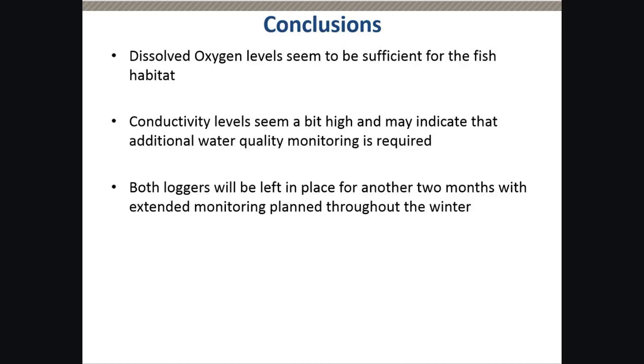Both of the loggers will be in place for another 2 months. After that, we will remove them. We'll replace that dissolved oxygen cap, relaunch both loggers with a longer logging interval, about every 30 minutes or so, and get them ready to winter over under the ice in the pond.